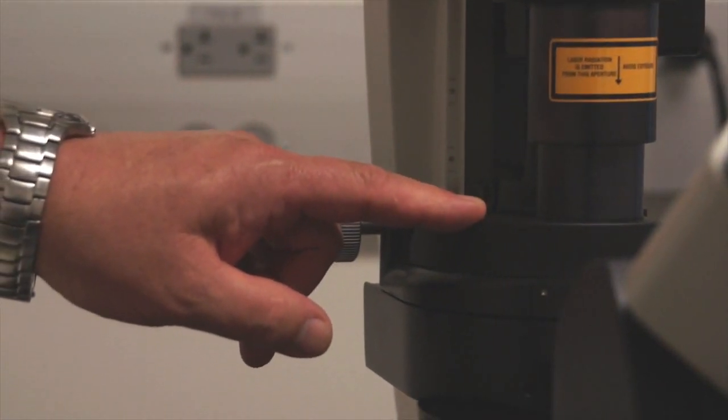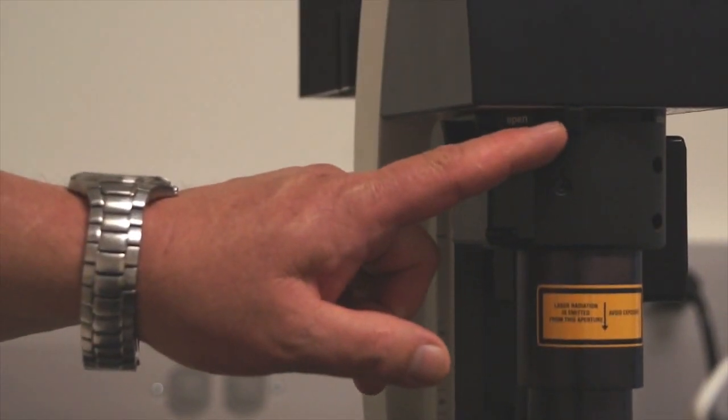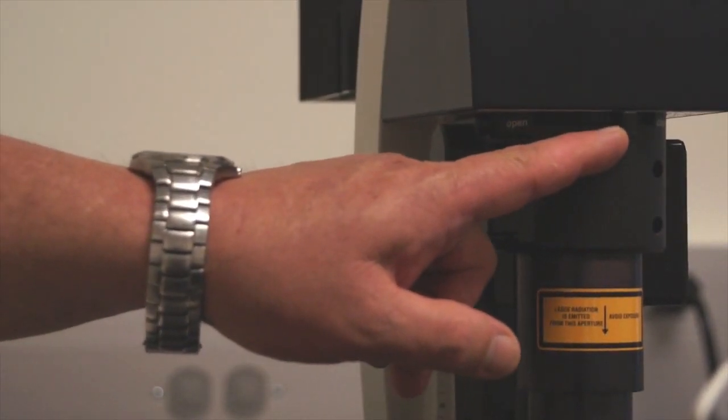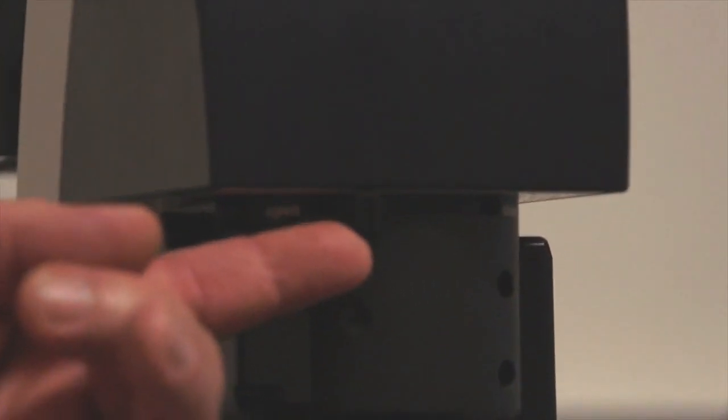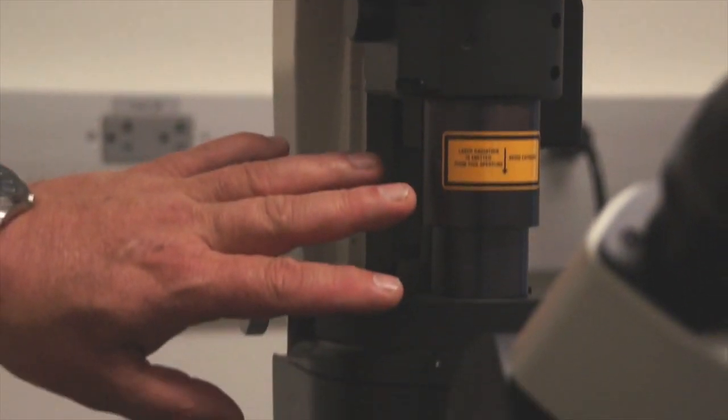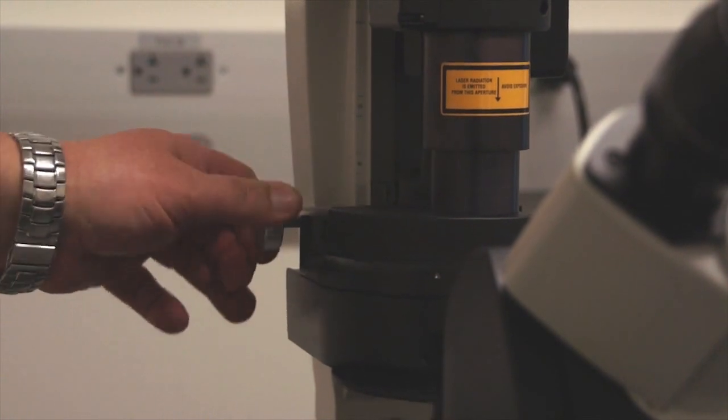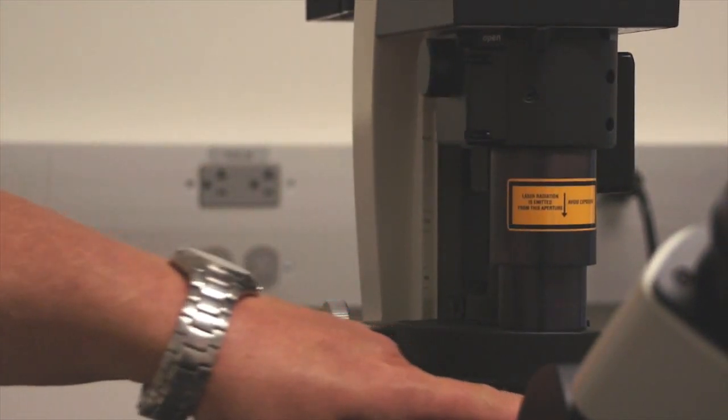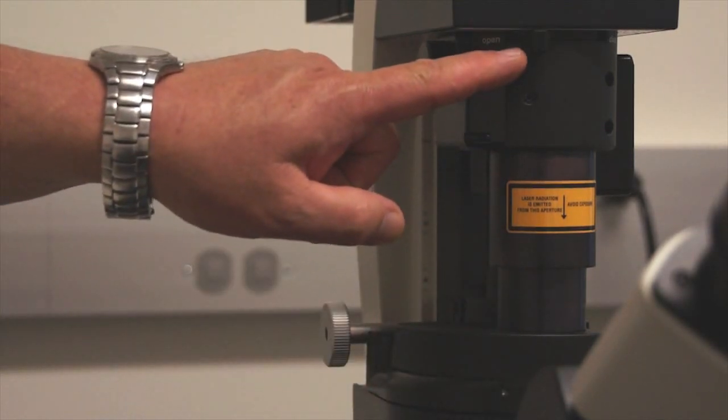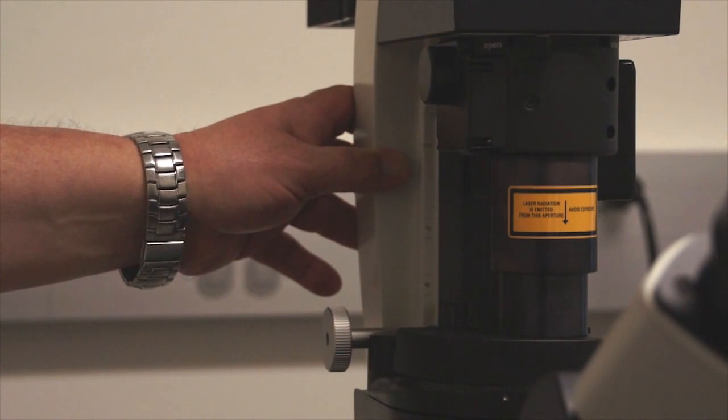And so the field diaphragm on this microscope is manual and it's located here, and so we would close this down and open it up so that we could see it in our field of view. And so we're going to discuss condenser alignment specifically as we did on the upright compound microscope, aligning the condenser, closing the field diaphragm, and then using the alignment tools in here to align the field diaphragm to the field of view.